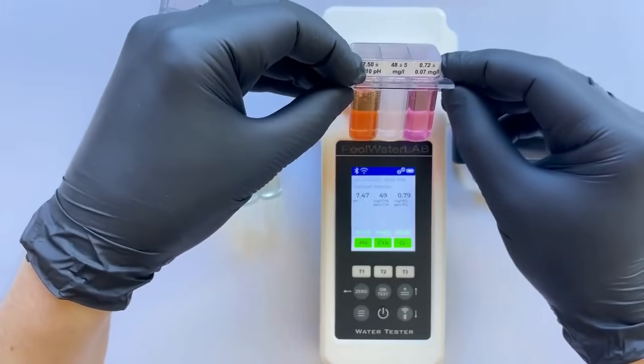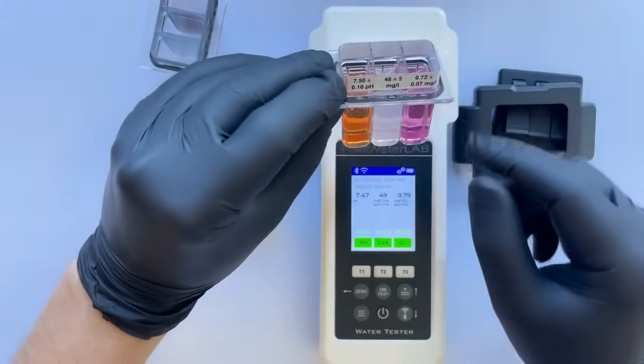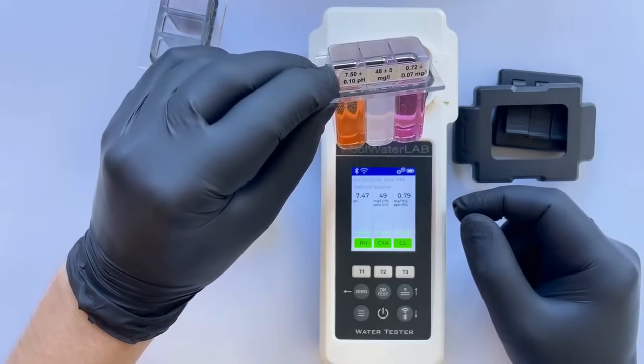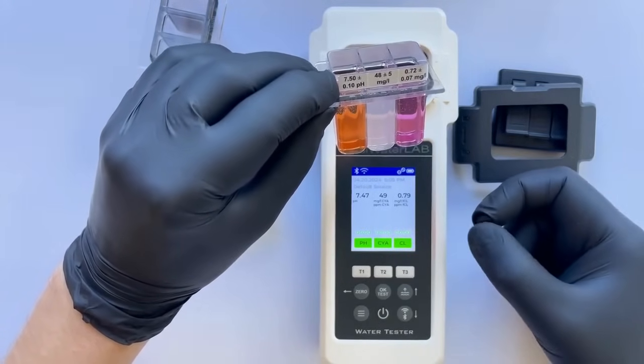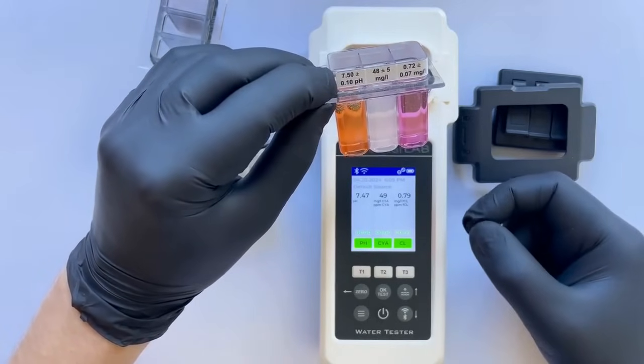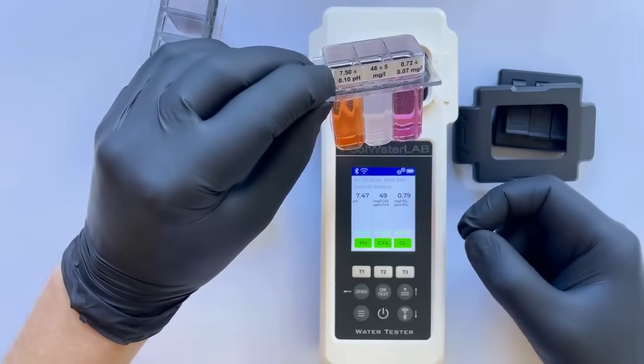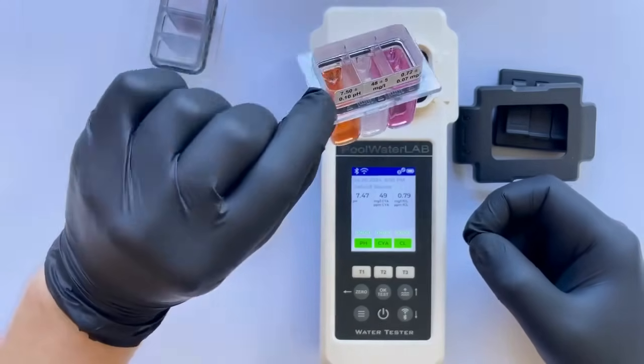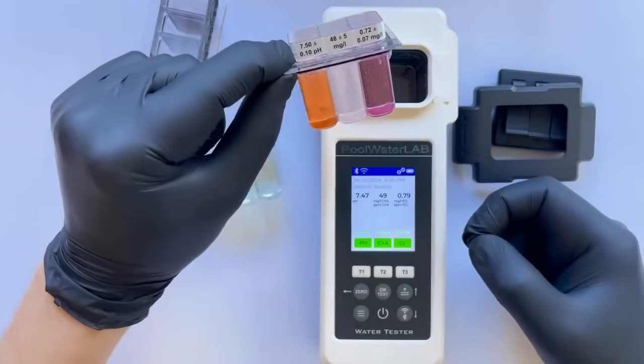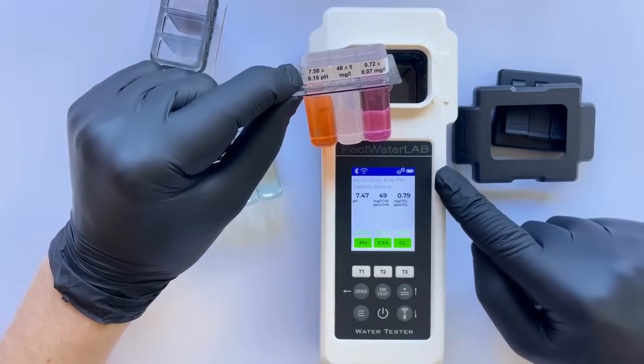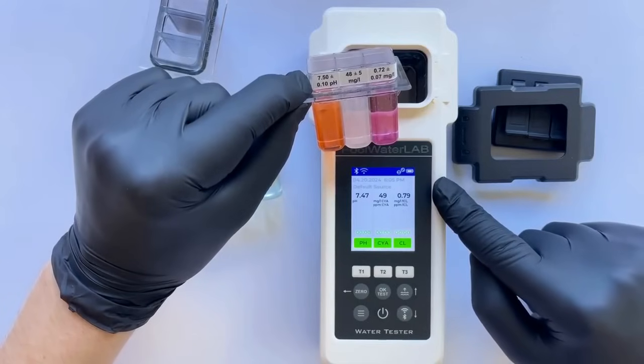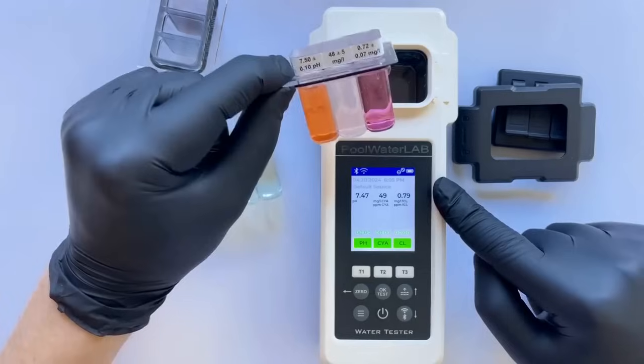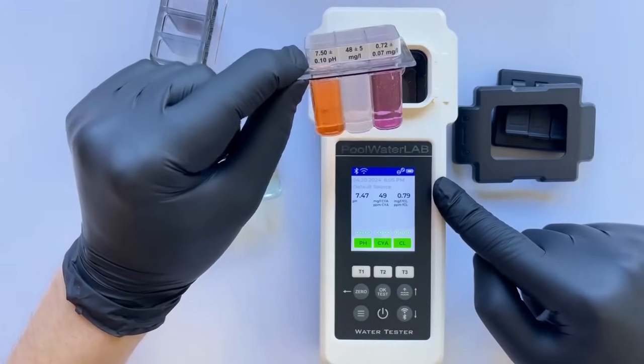Therefore, we can conclude that the tester meets the L1 accuracy level, the highest standard of precision currently accepted in the USA. For reference, the L1 accuracy level permits an allowable error margin of plus or minus 12%. This range is considered acceptable for ensuring reliable and accurate results within the defined standards for precision. However, we observe that the pool water lab tester demonstrates significantly less deviation than what is typically allowed for L1. This precision exceeds standard expectations, highlighting the tester's superior performance in ensuring highly accurate water quality measurements.